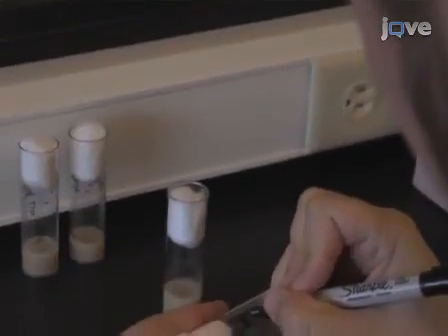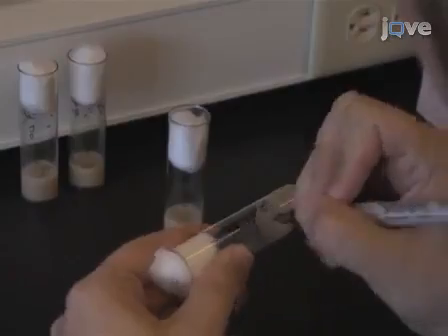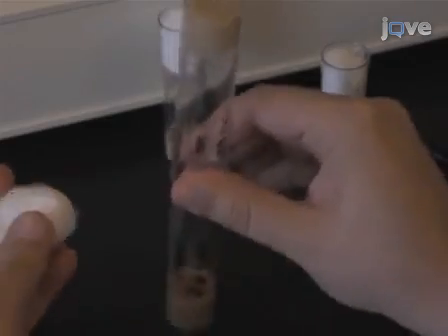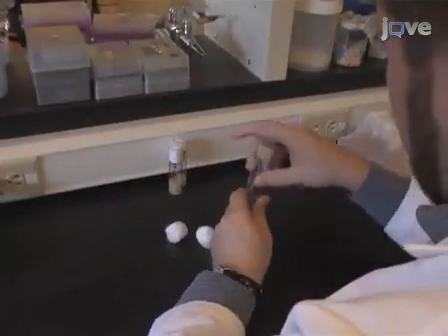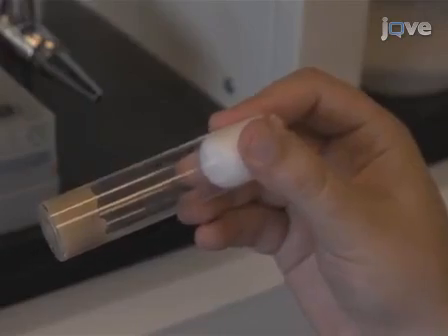In order to expand transgenic lines, set up 2 vials with several male and female flies. On alternating days, transfer the flies from one of the vials into a new vial. Repeat this for a week. By the end of 2 weeks, verify that the transgenic fruit flies range from larval to adult developmental stages.